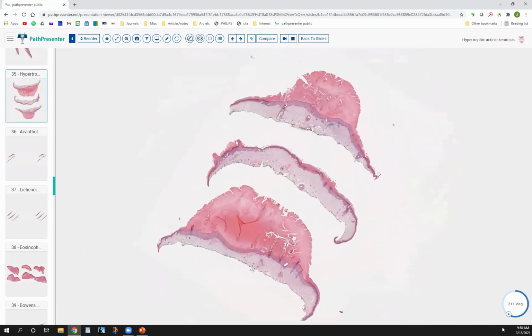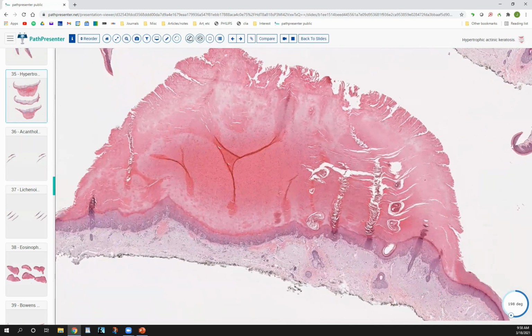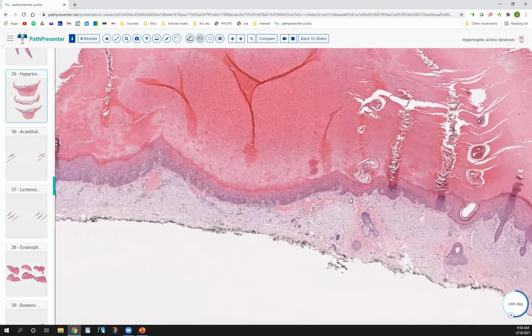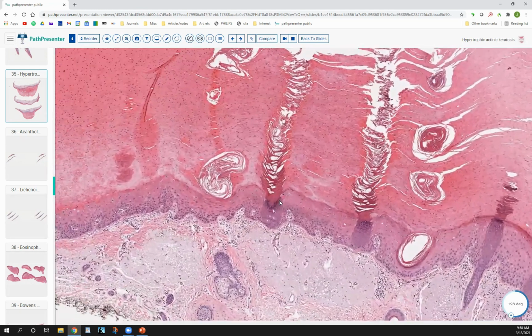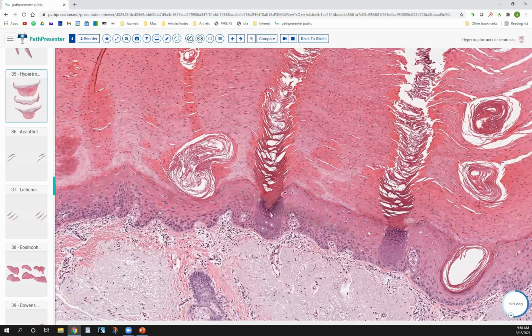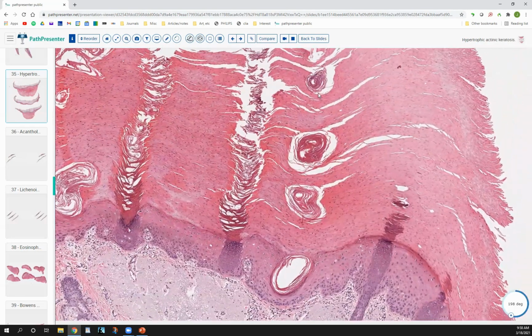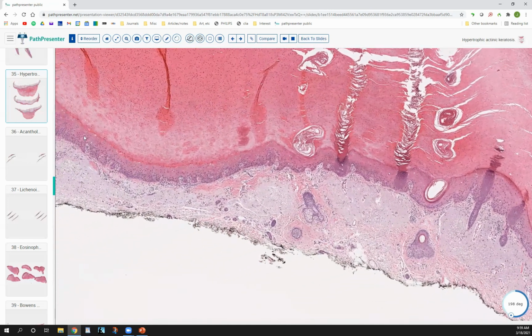So we'll move on to this case, which is an actinic keratosis that just happens to have a lot of hyperkeratosis. Sometimes we'll use the term hypertrophic actinic keratosis, which I think would be appropriate here. But you do see still the important features that I was talking about. Those are retained in all actinic keratoses. So you see this very nice sparing of this eccrine duct right here and this eccrine duct right here. Maybe some sparing. I think there's a follicle right here, so you can see that sort of sparing. And this picture is so characteristic to be able to identify something as an actinic keratosis, sometimes in cases where the biopsy is not the best or it's not as obvious. And of course, your atypia confined to the basal layer and your solar damage.